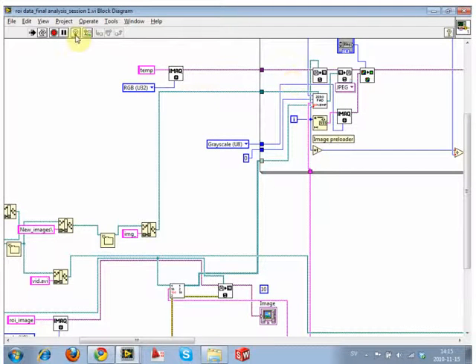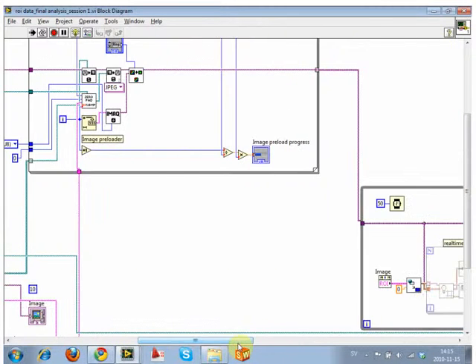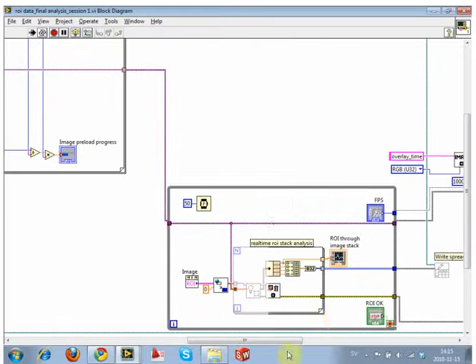But why don't we have an error? Because it might not be an error. So what is the problem? I don't know yet. I haven't run the error thing yet. It's most likely stuck in a loop. Where it's transparent, it means the problem is here.